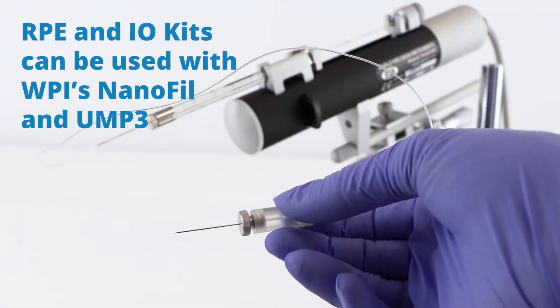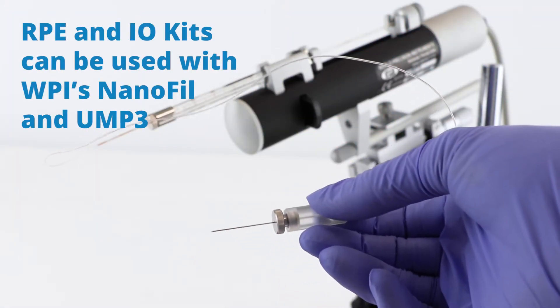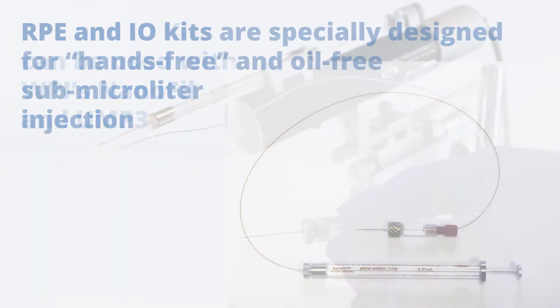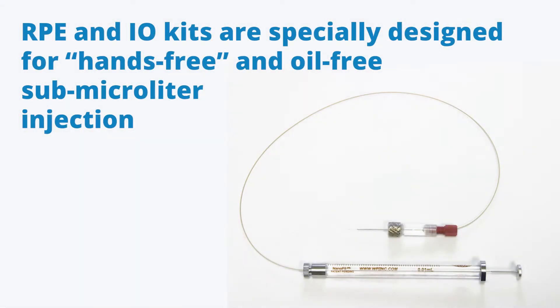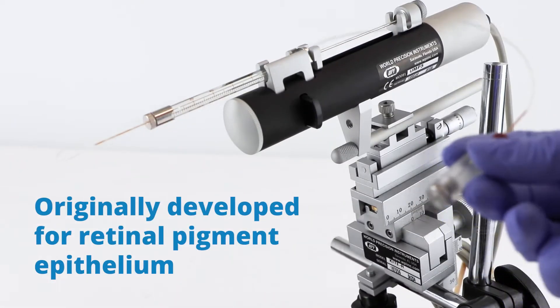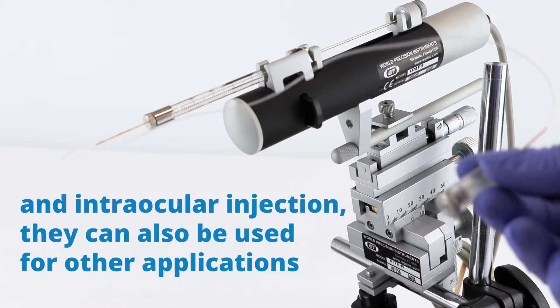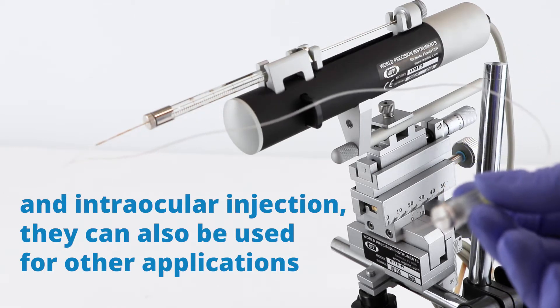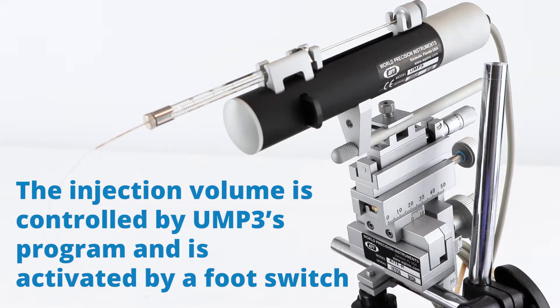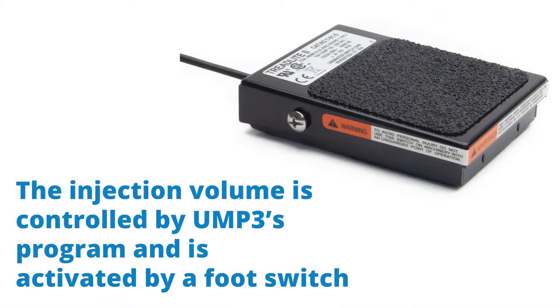RPE and IO kits can be used with WPI's NanoFil and the UMP3 the way it's set up here. Retinal pigment epithelial and intraocular kits are specially designed for hands-free and oil-free submicroliter injection. They were originally developed for retinal pigment epithelial and intraocular injection and can be used for other applications. The injection volume is controlled by the UMP3 program and is activated by a footswitch.